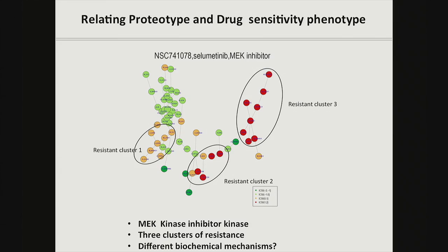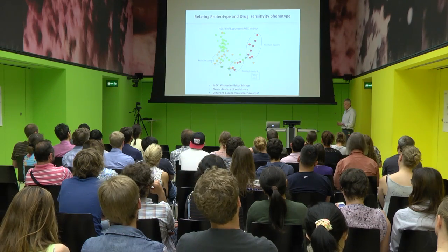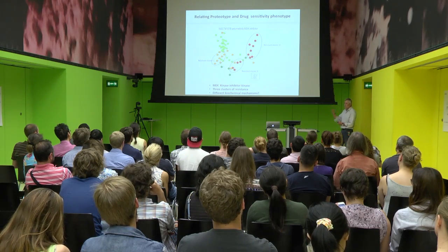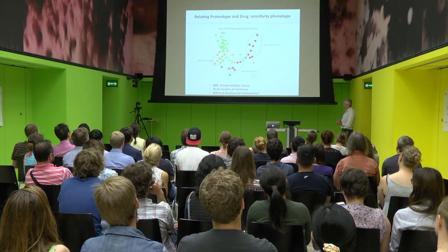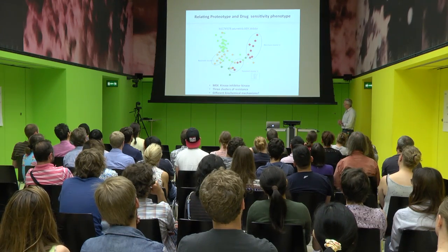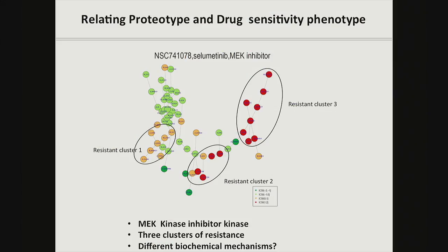So we can see here that there are cell lines clustered together, so they are quite similar in their proteome, and some are far apart. Now Tiannan painted these cell lines with a certain color, cold colors or hot colors. The hot colors are resistant cell lines, and the cold colors are cell lines that die when the drug is added.